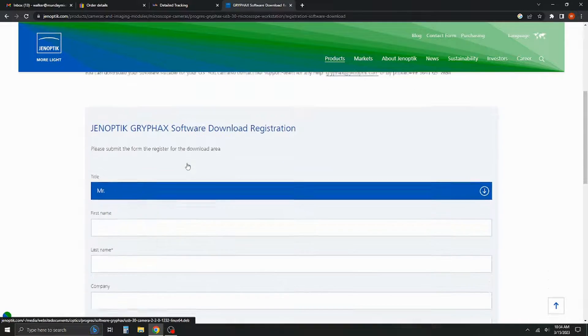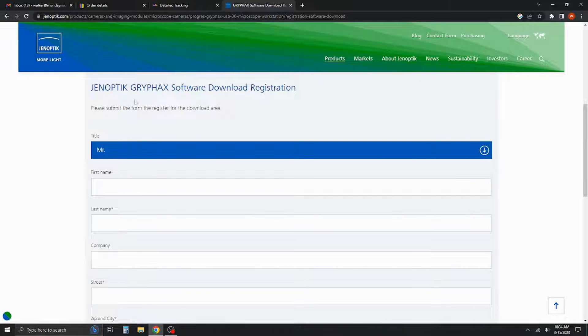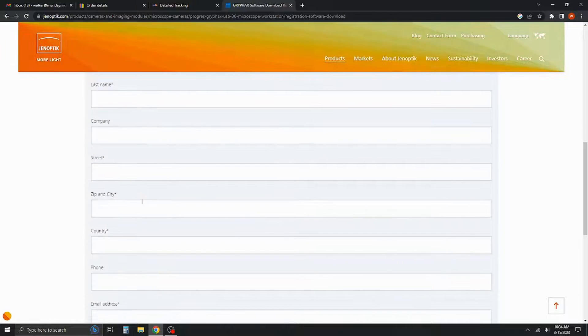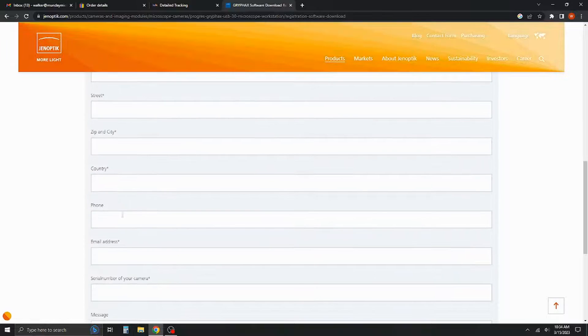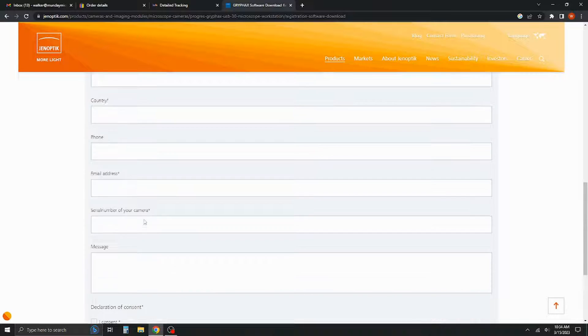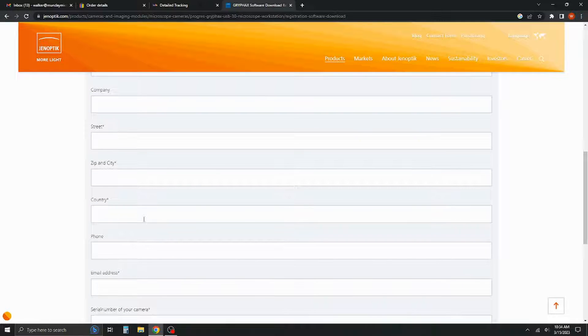You'll go through and you'll register your software. It's going to ask you just some basic information as well as the serial number for your camera. That will be on the outside of the box.